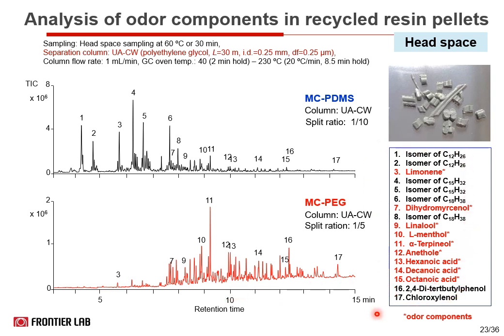So in conclusion, solid phase extraction with both non-polar and polar Magic ChemSolvers, MC-PDMS and MC-PEG, and thermal desorption GCMS using the Py-GCMS system allowed the detection of both non-polar and polar additive components from recycled polypropylene pellets.